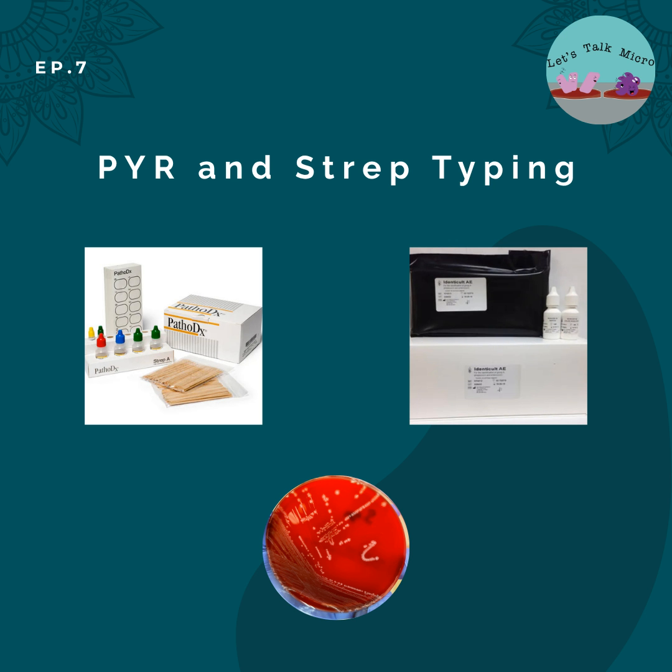But the flow chart that I released was just for gram-positive cocci. So we do use it for gram-positive rods. The most common species that we use the catalase for are Bacillus, Corynebacterium, Listeria, and Lactobacillus. Now, if you're a student, do you remember the reactions for each of these?